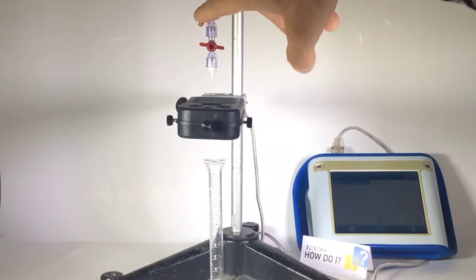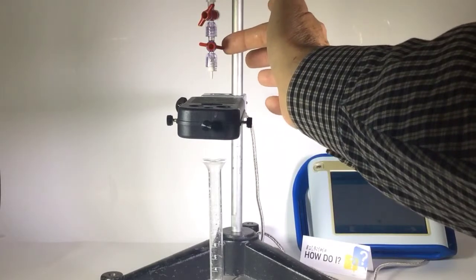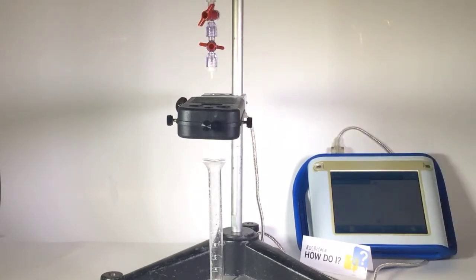I've already adjusted the top to a nice steady drip. The bottom stop cock is basically just to turn it on and off.